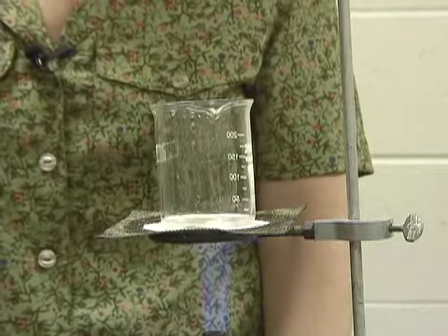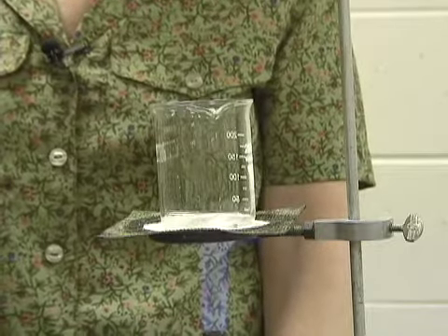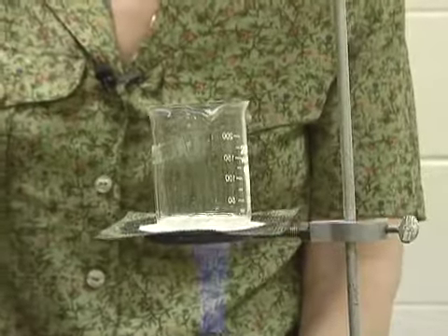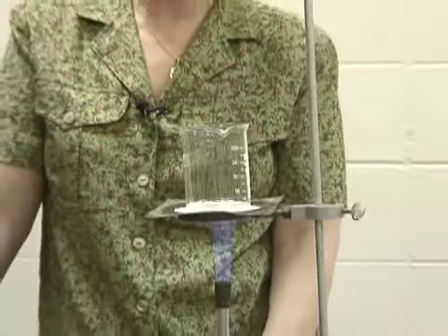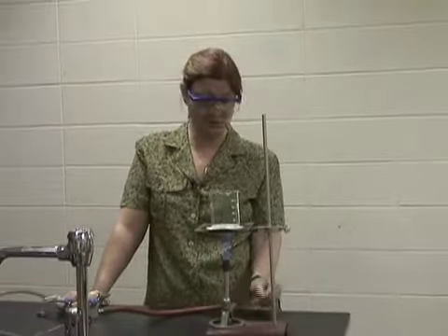Evaporating that water out of there, because our acids are aqueous solutions and they have different concentrations, and we'll talk about that in the next semester. But right now we just know that this was the solution that we needed.